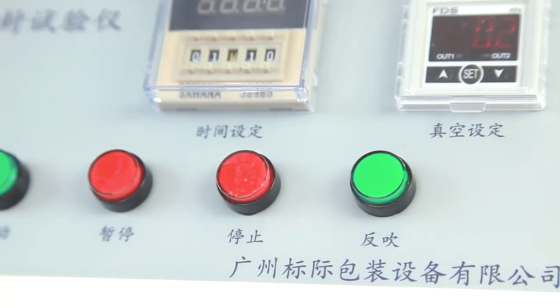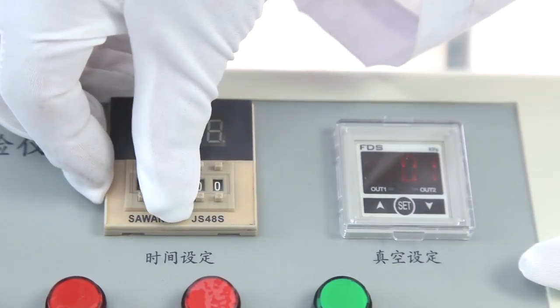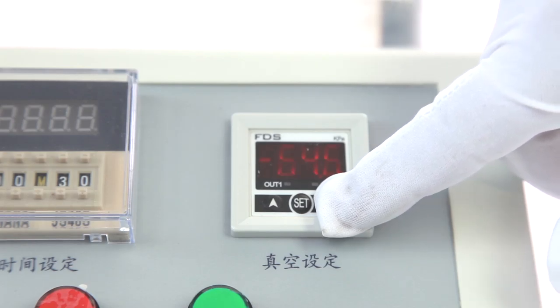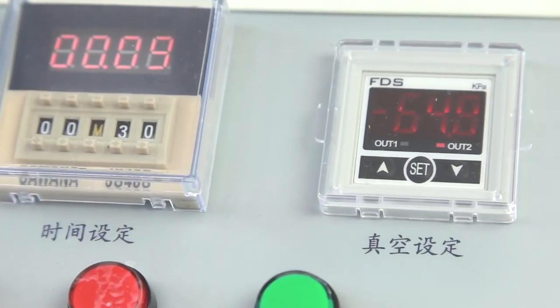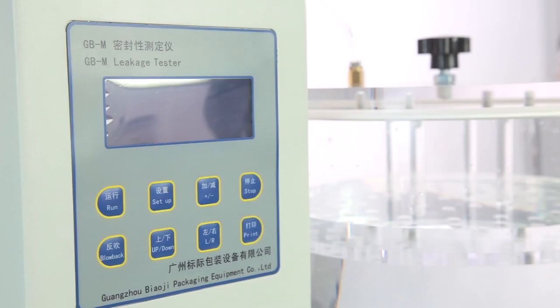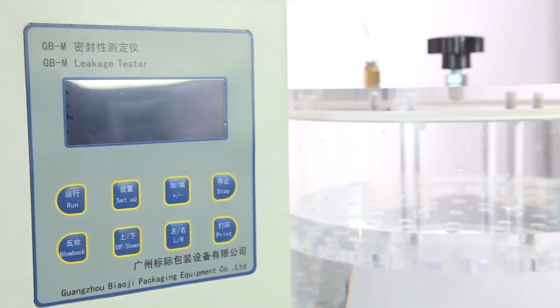GBM uses compressed air as drive force and uses a vacuum generator to create vacuum. It can set parameters with fast speed and high precision, with automatic running according to specified vacuum degree and time, automatic stop, and automatic return.